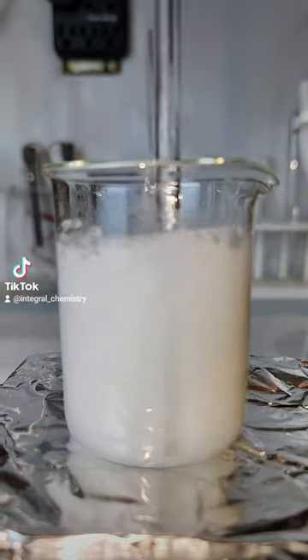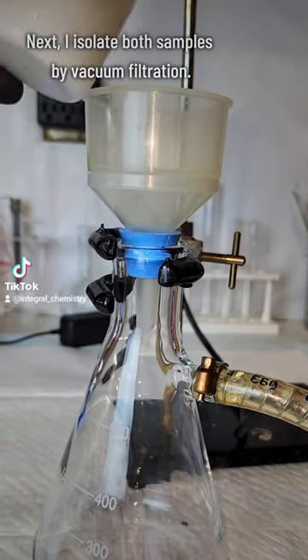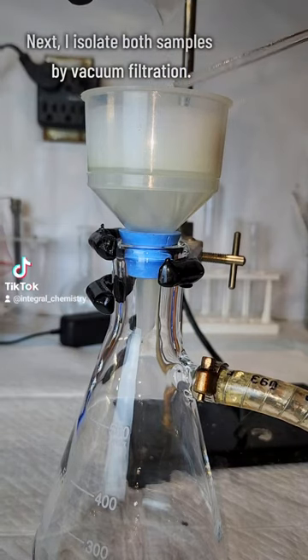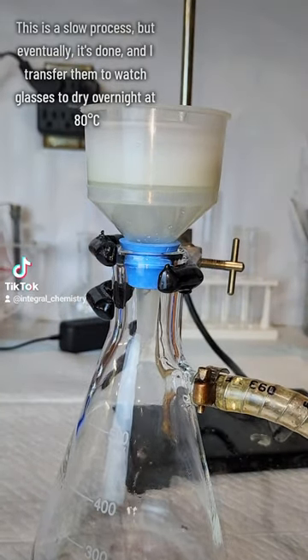Once both of my hydroxide salts are finished, I load both of them into a Buchner funnel separately to isolate them by vacuum filtration. I do the indium first and then the yttrium, and this actually takes a good while because both salts have a slimy, snot-like consistency that's really good at gumming up the Buchner funnel.